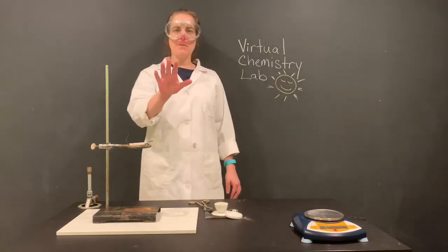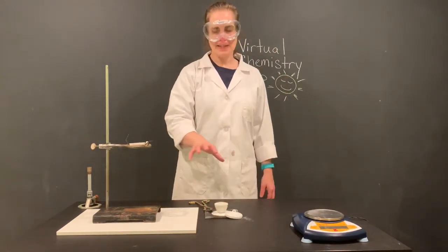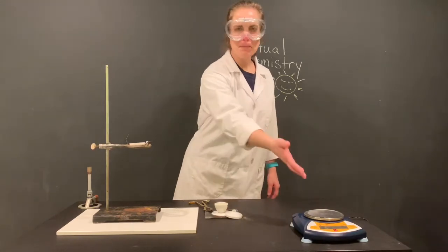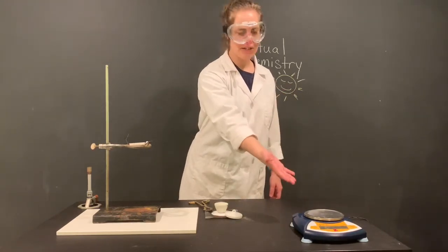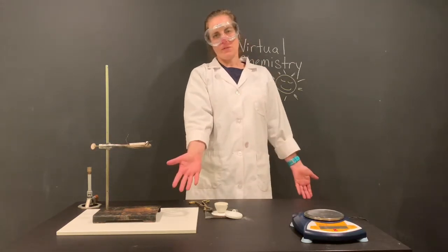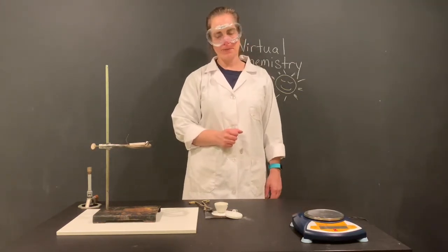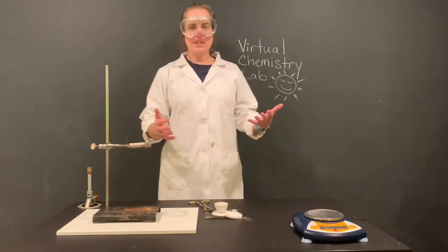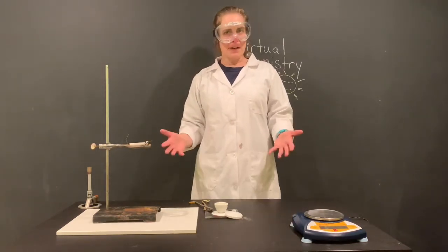Now just a friendly reminder, we needed to wait until everything cooled because we cannot put a warm object on a balance. It throws off the balance. So we have to wait until, I guess, to room temperature before we're able to actually take that measurement. Well we've done our first heating, and now we're going to do another heating.